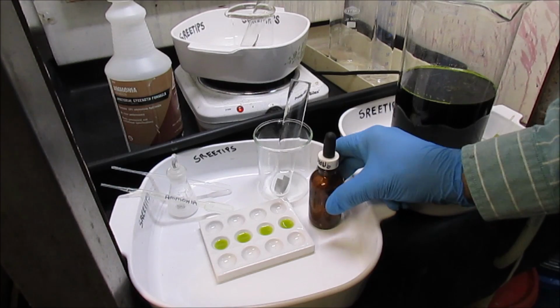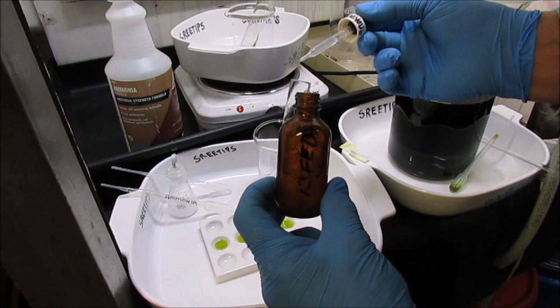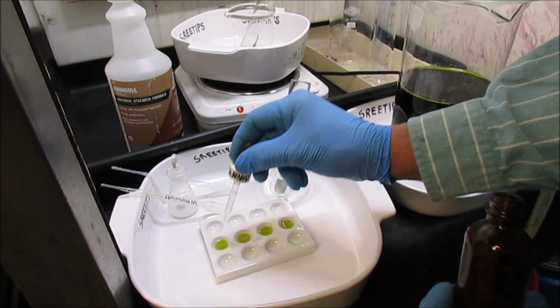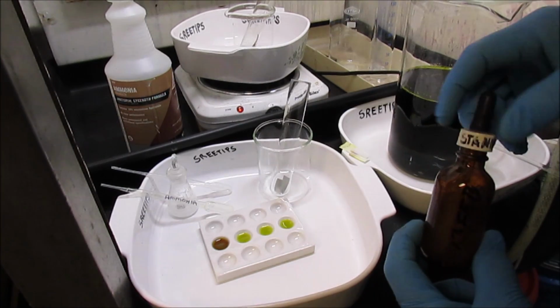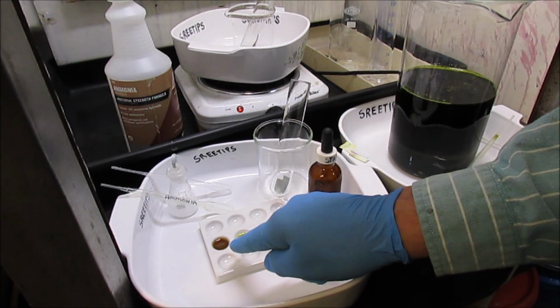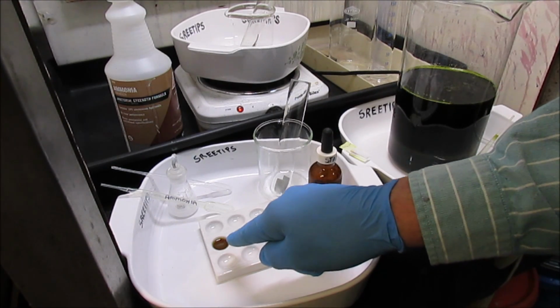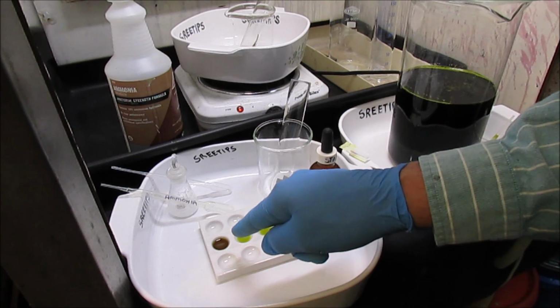See what we got in solution. First off is some stannous chloride, freshly prepared on 13 February. And as you can see, I got an orange reaction here, which is an indication that I have platinum in solution. Probably a little bit of palladium as well.